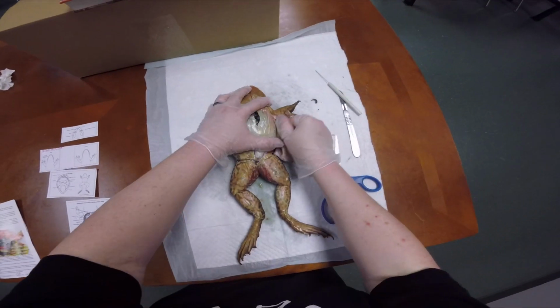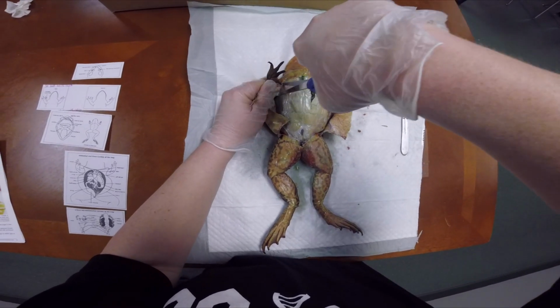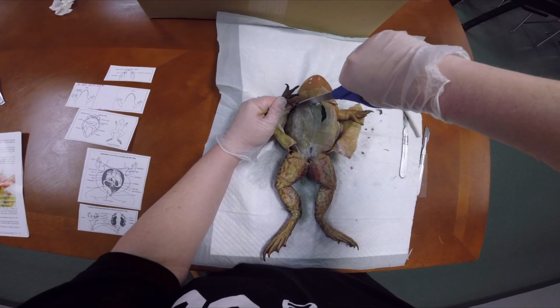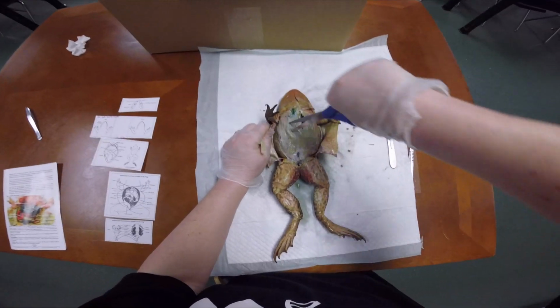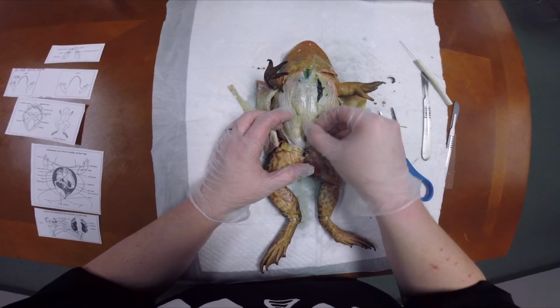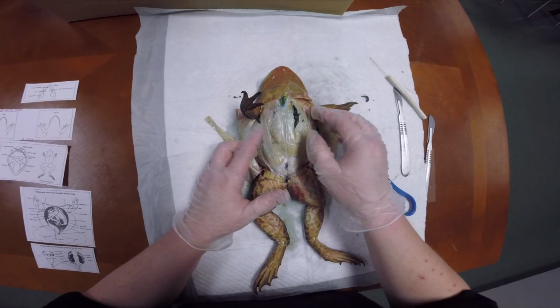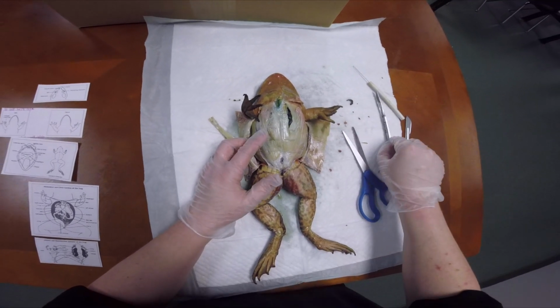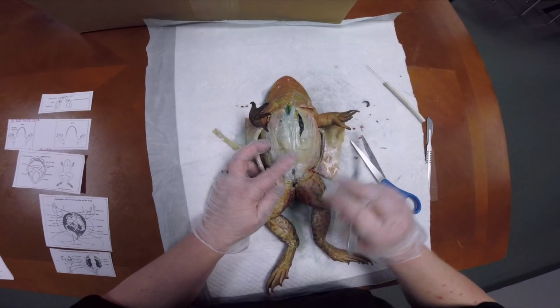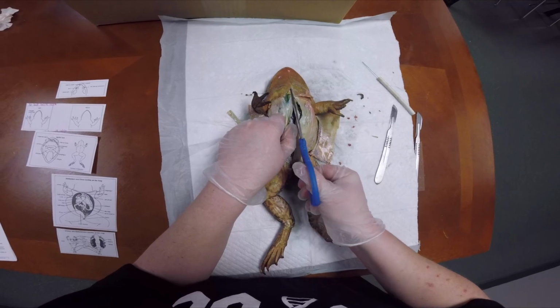Then pull that there so it's out of the way. So we got to get through this muscle too. I'm just going to take a shortcut here and do that. Alright, so now you can see we have this muscle wall that we need to get through as well in order to see all of the inside parts that we need to see. Okay? So I'm just going to find where I started my cut. I'm going to go very gently, because I don't want to mess up the insides. And then I'm going to bring my scissors in here.